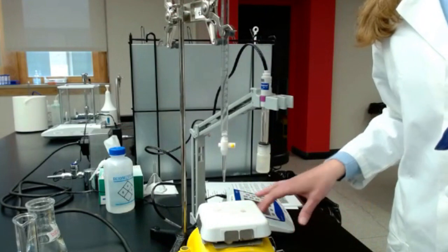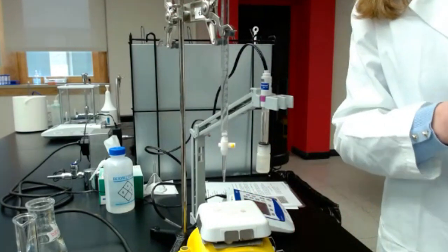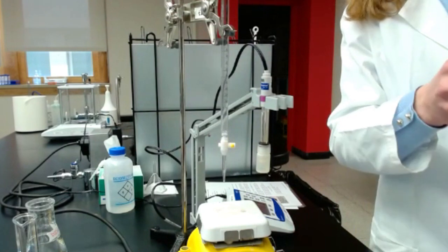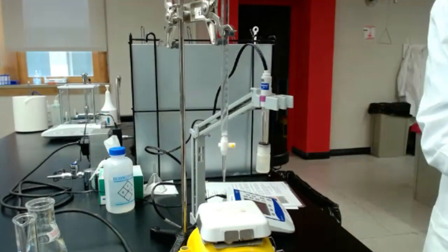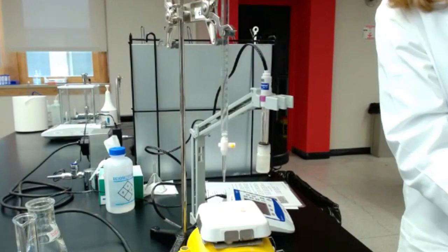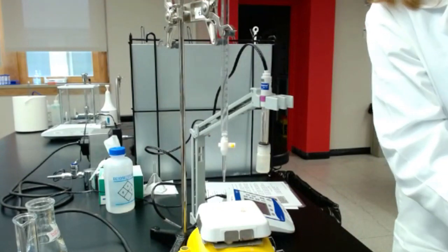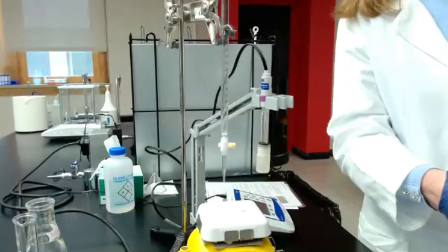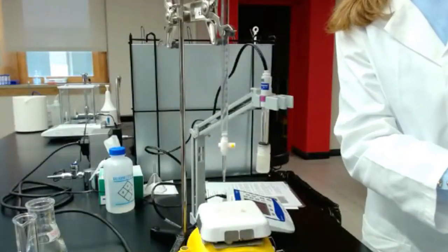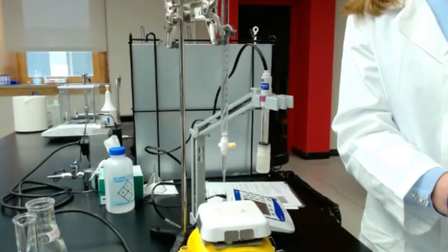If you don't have a pH meter, make sure you have the phenolphthalein, the color indicator I mentioned earlier. Then, if you have a pH meter, you should have buffer solution, because that's going to be the first step that we do: calibrating the pH meter.